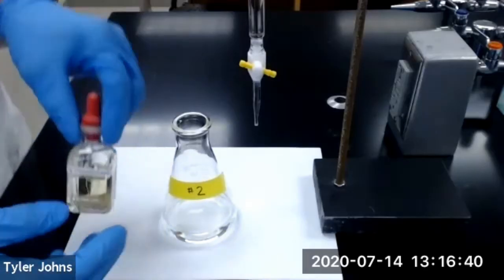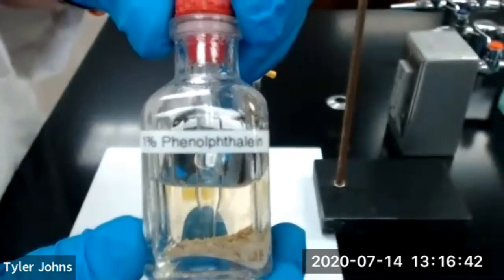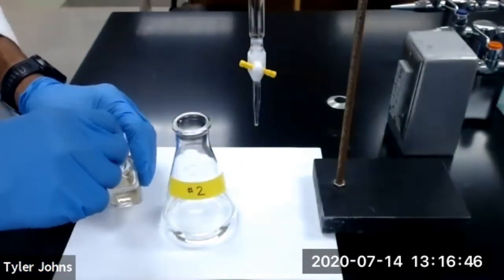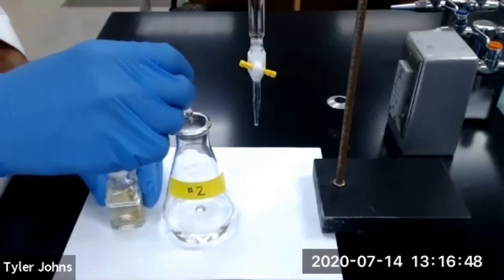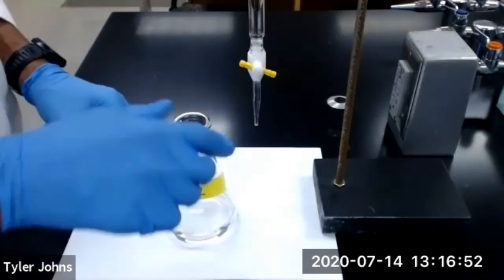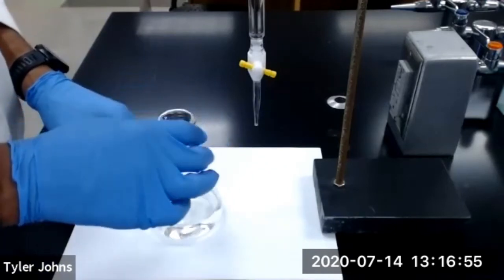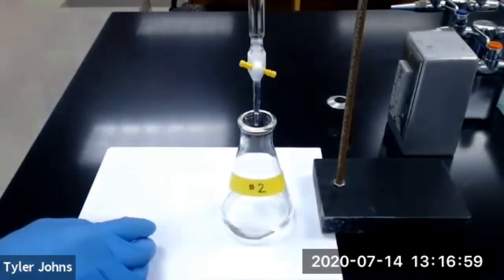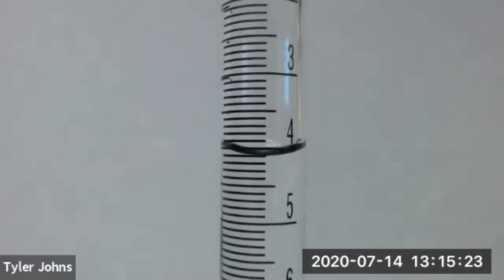We will now add three drops of our 1% phenolphthalein indicator to our second Erlenmeyer flask. We're now ready to begin titration of trial number two. This is the initial burette reading for trial number two.